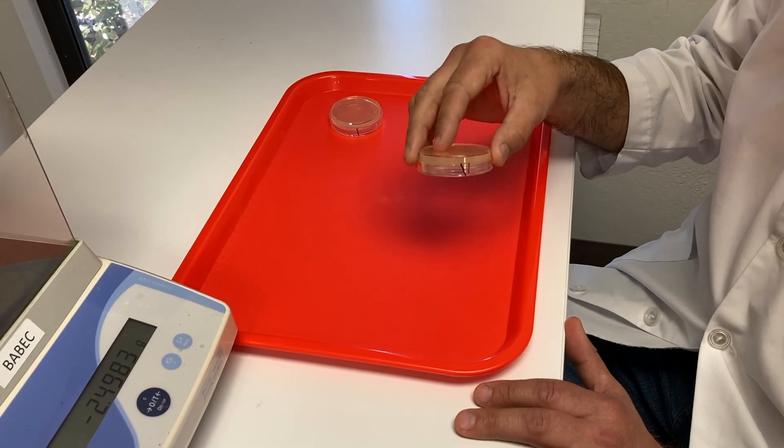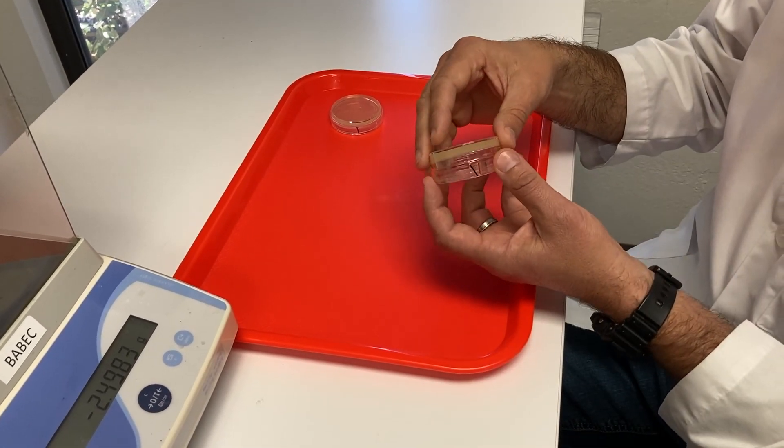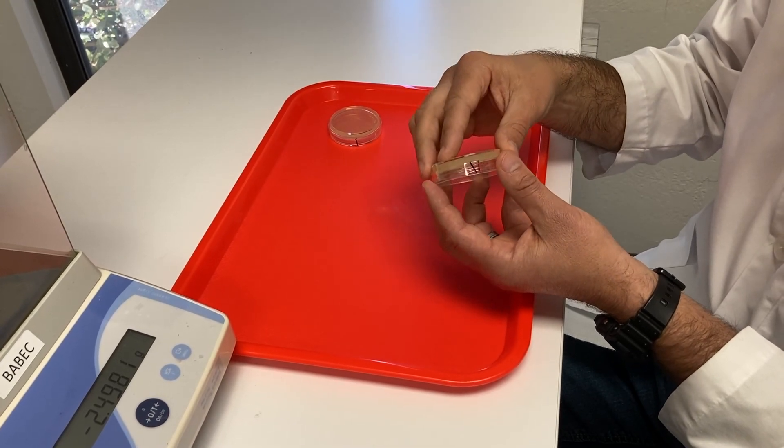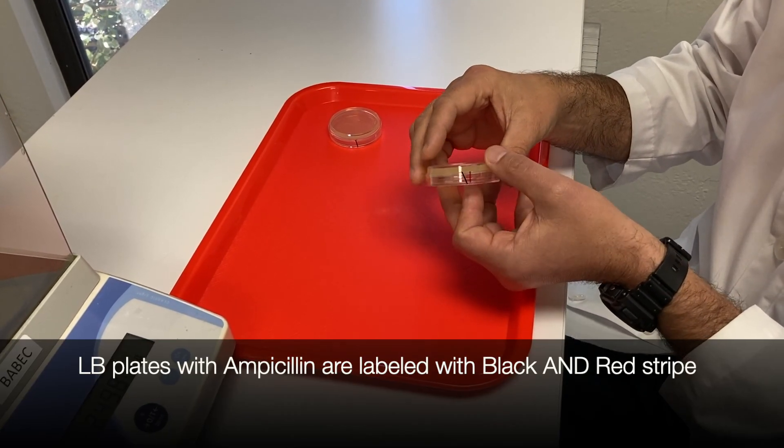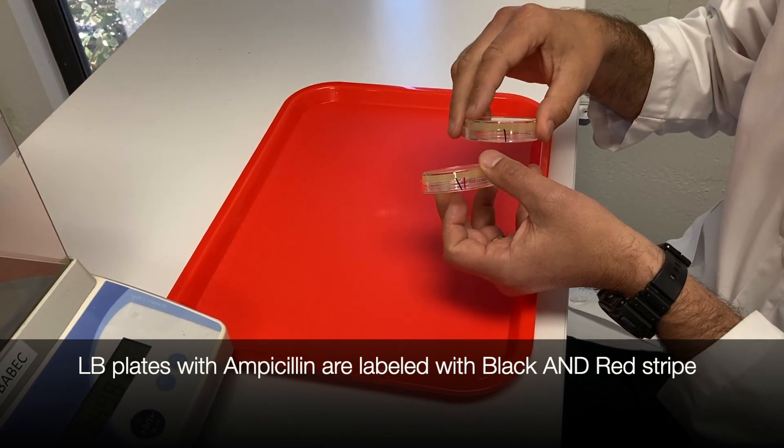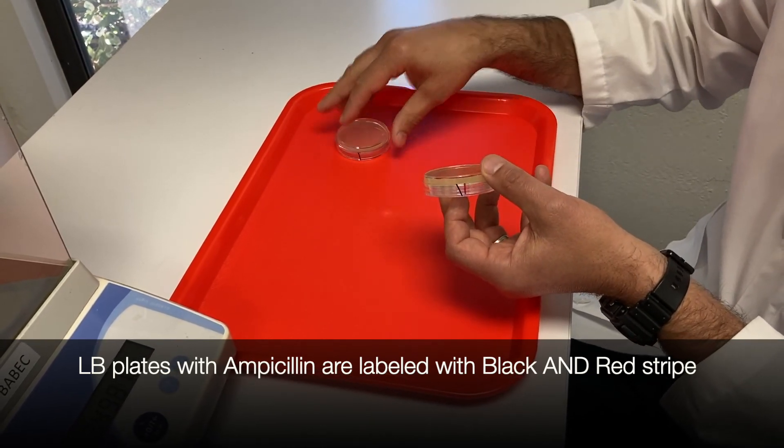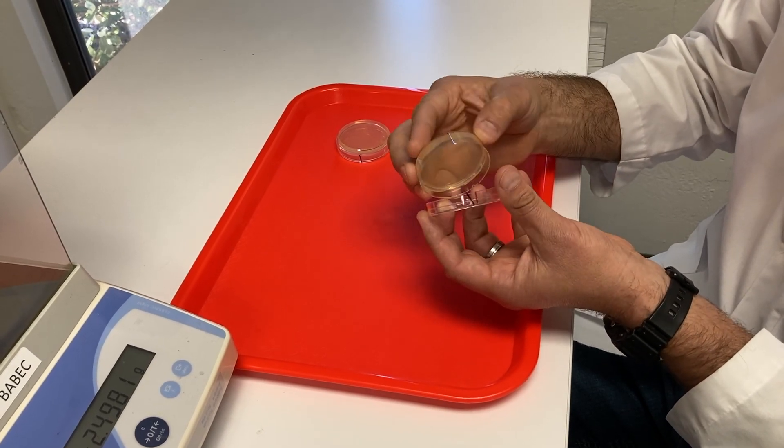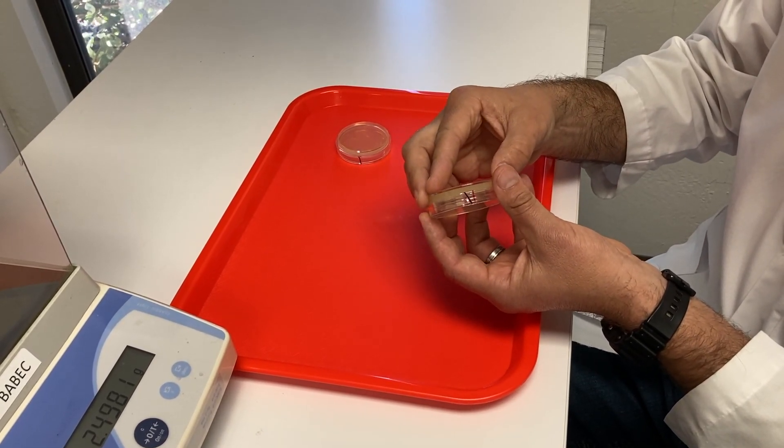Once the LB agar has cooled, it is solid in the dish. There is now a surface for the bacteria to grow. Remember, these plates also contain the antibiotic ampicillin. Therefore, only bacteria that are resistant to ampicillin will be able to grow. The ampicillin will kill all other bacteria.